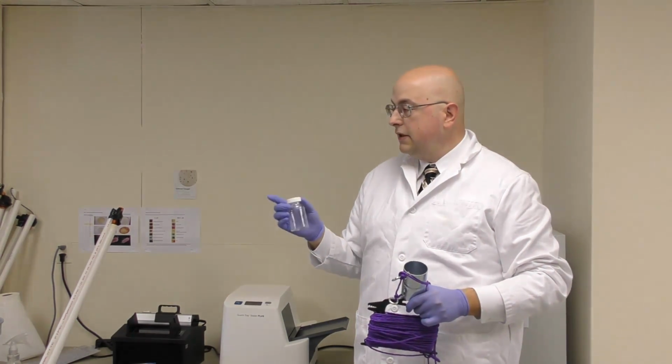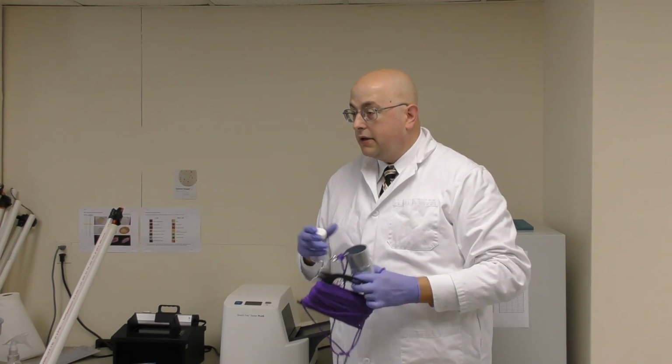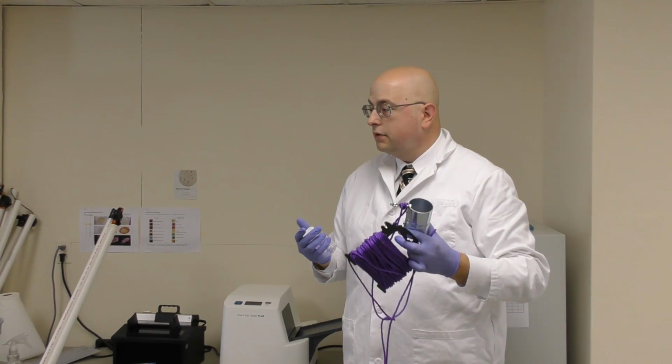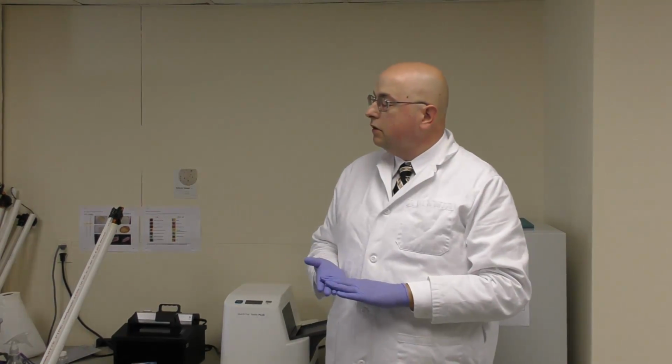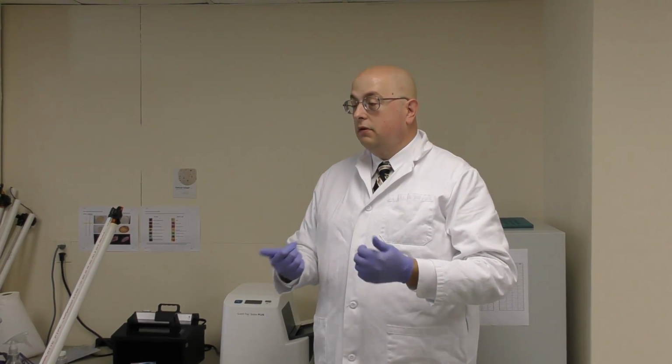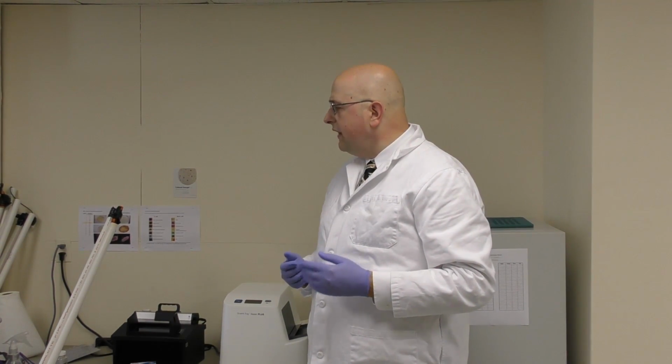So we've provided some of these materials for you. These were basically made from hardware supplies, probably $2, $3 for the materials required. There would also be included a cooler for transporting your samples. You would want to have a Sharpie marker, preferably labels to label your bottle, so you can put your information on there. You'll have a field sheet to record your field conditions, the time that you collected your sample, because the laboratory will need that. And that's pretty much it.